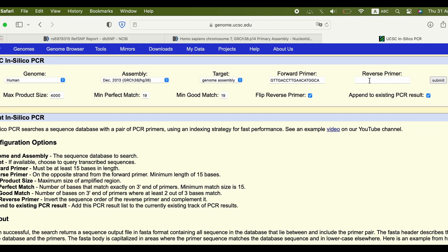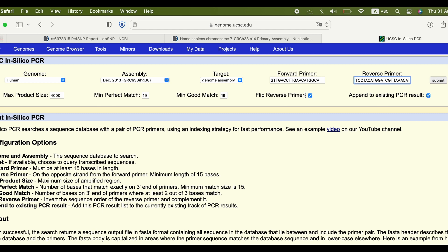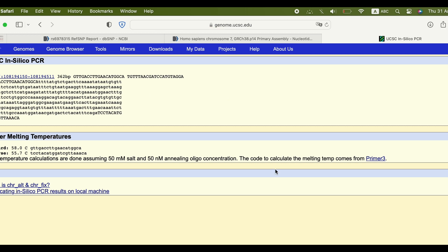Make sure to keep flip reverse primer checked. The reverse primer is the flipped complementary of the original sequence. Also, make sure to make iron perfect match match the number of nucleotides of the inner primer. Now click submit.